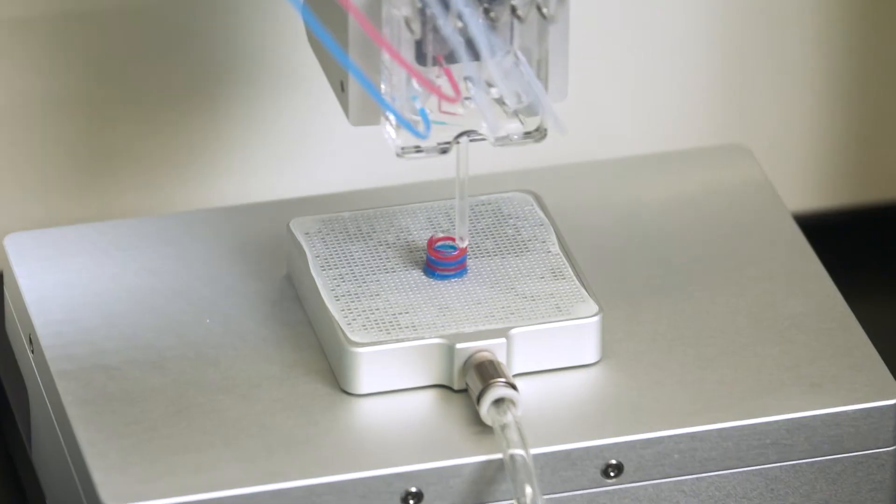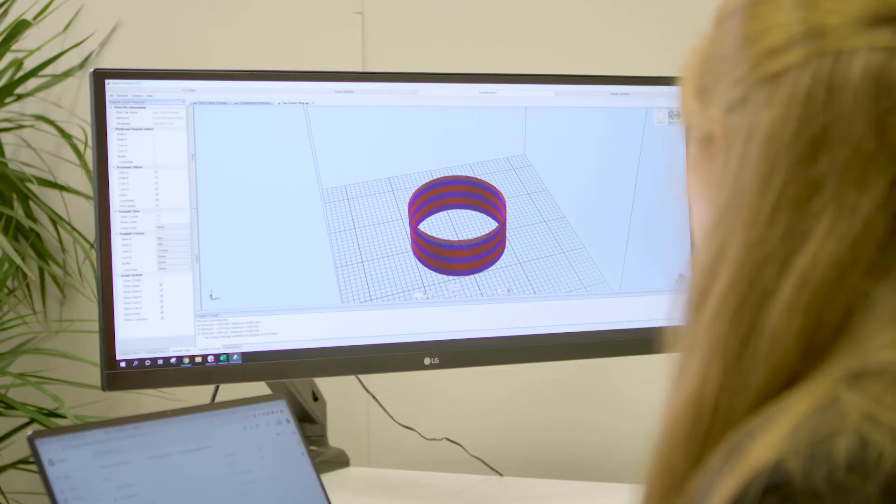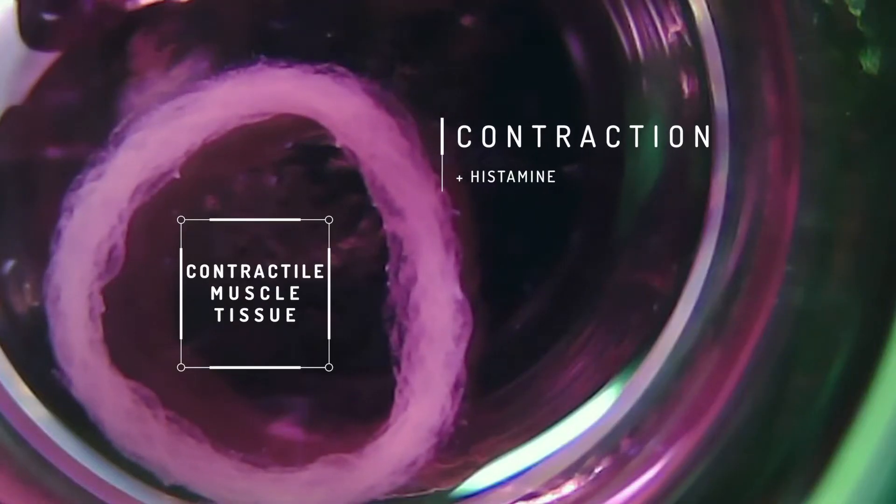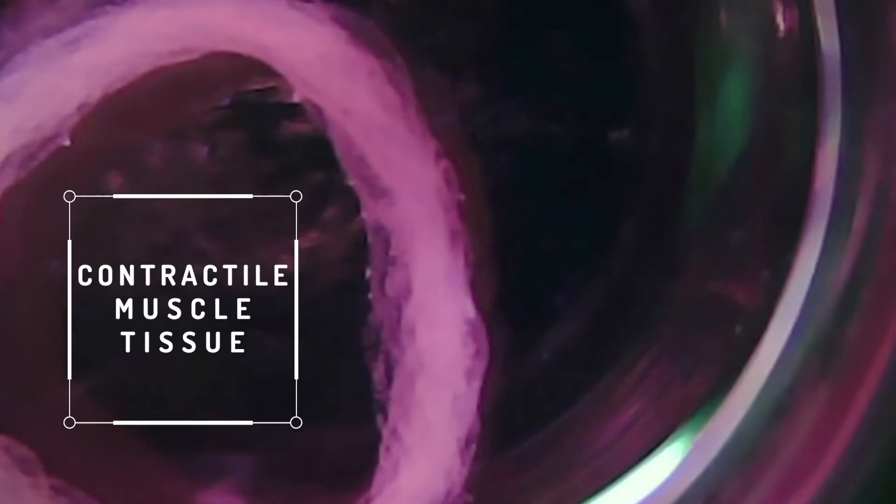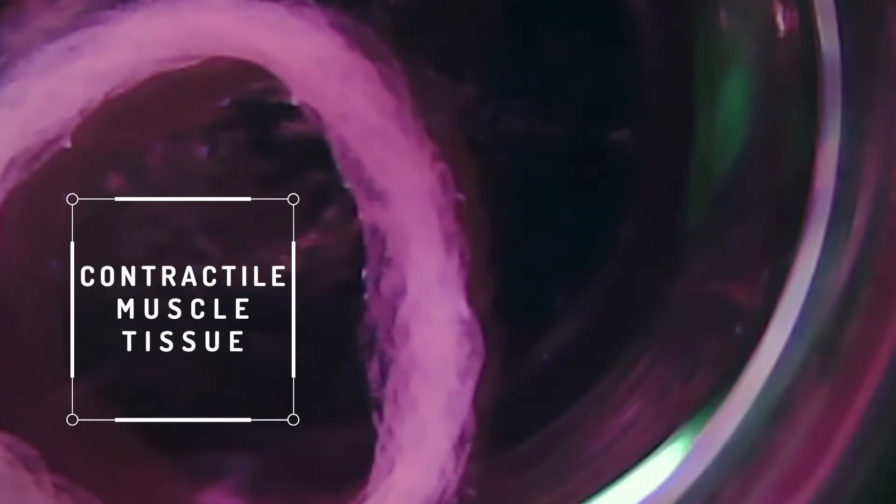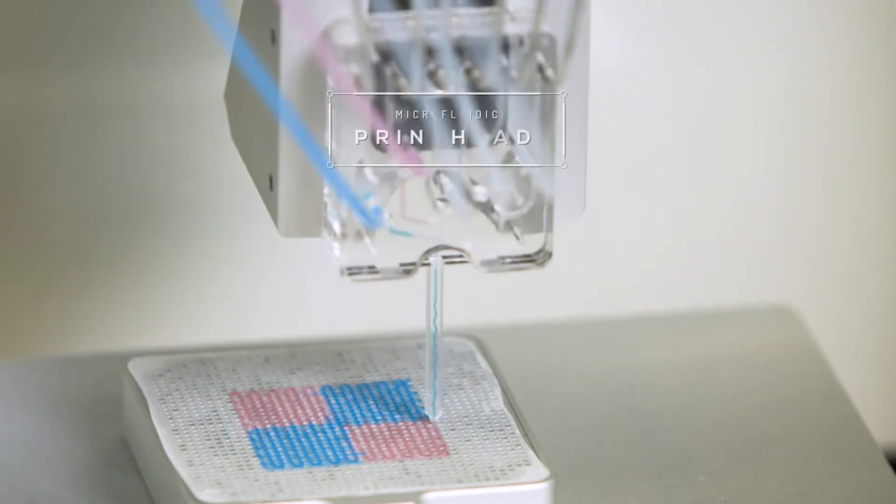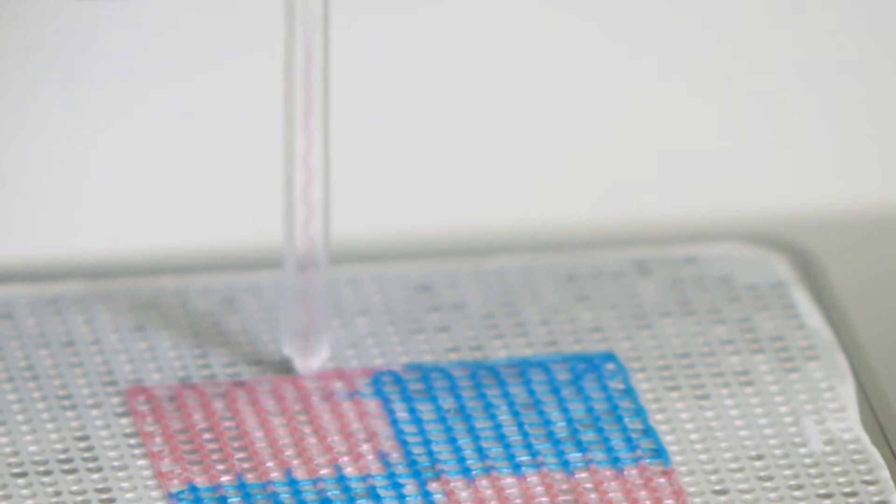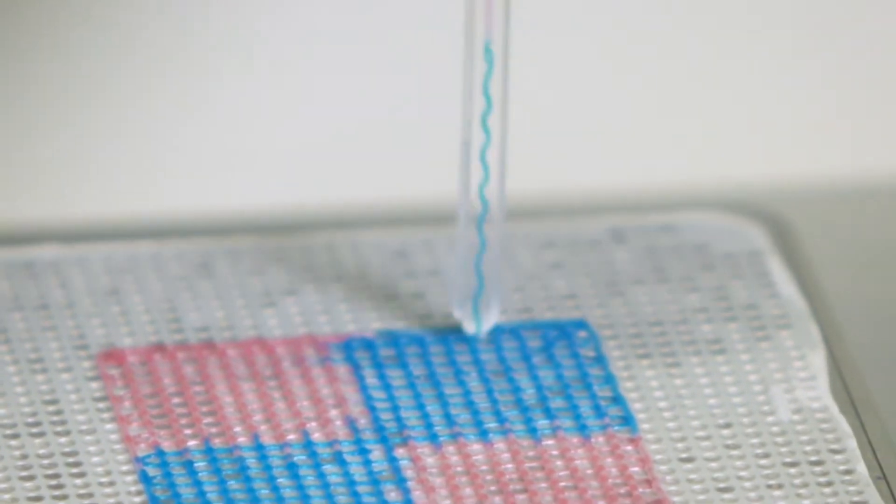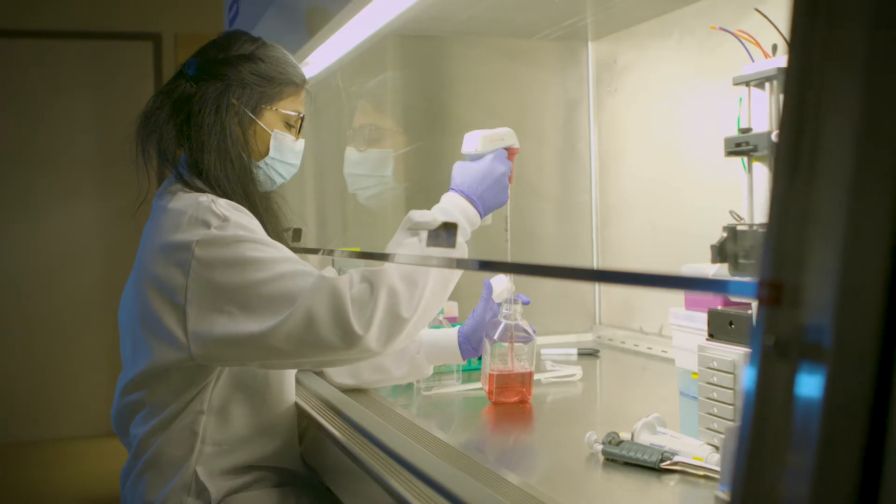Aspect Biosystem's microfluidic 3D bioprinting technology patterns cells and biomaterials into functional tissue-like structures. At the heart of the technology are Aspect's microfluidic printheads, which dispense cell-containing fibers—the building blocks of bioprinted 3D constructs.